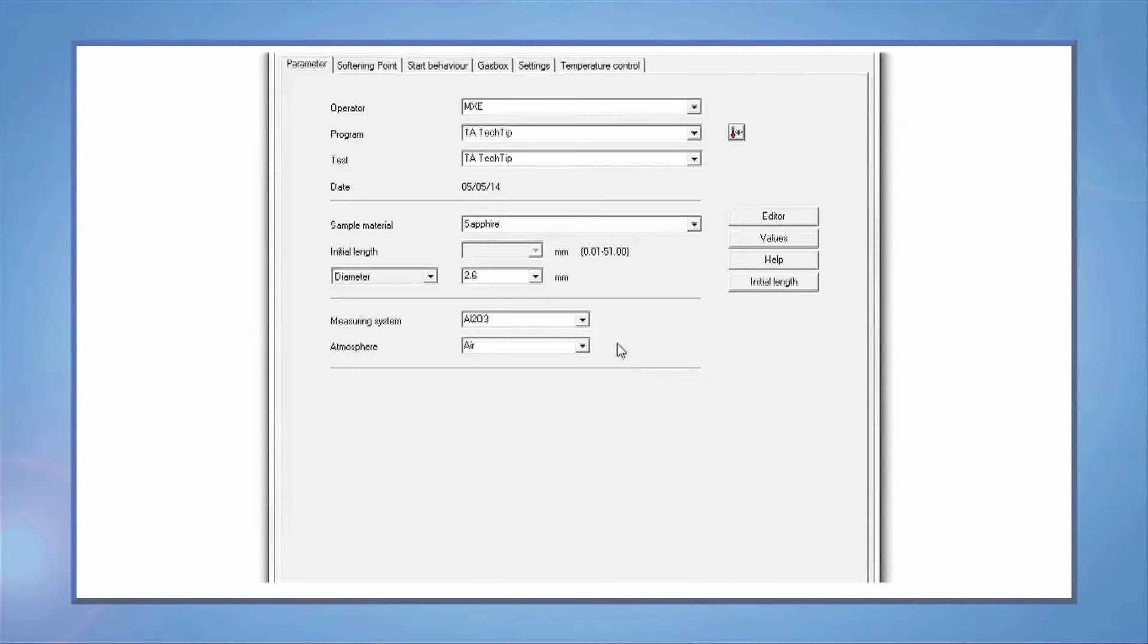On optical dilatometer, you will need to press the initial length to measure the length of the sample.